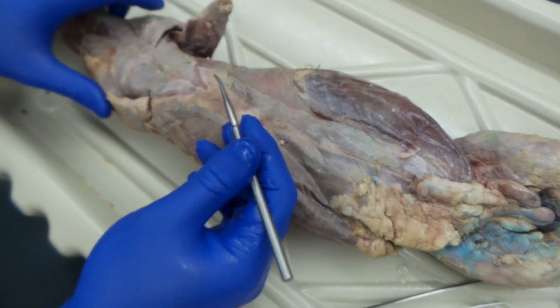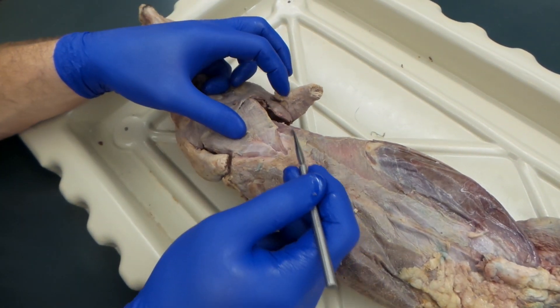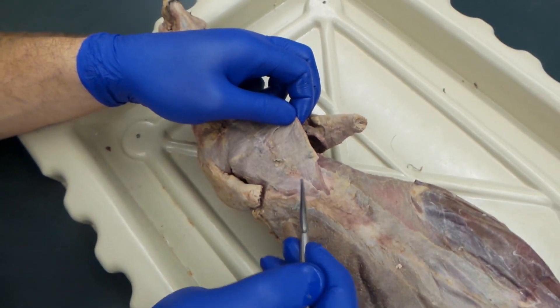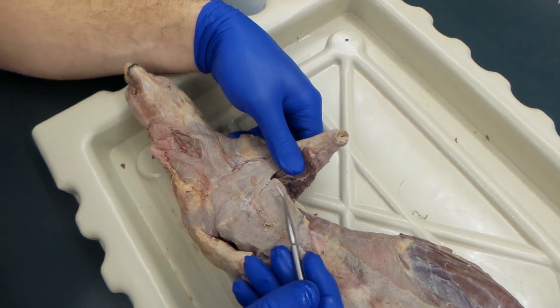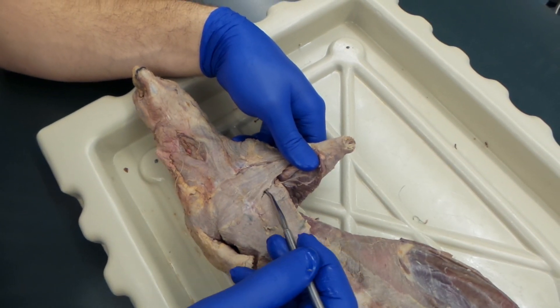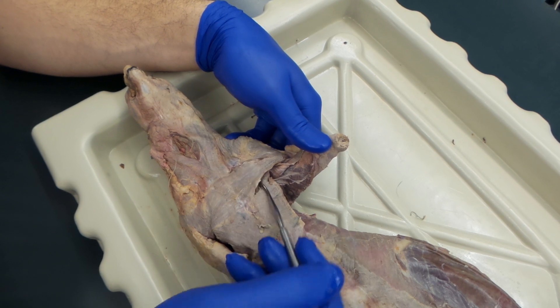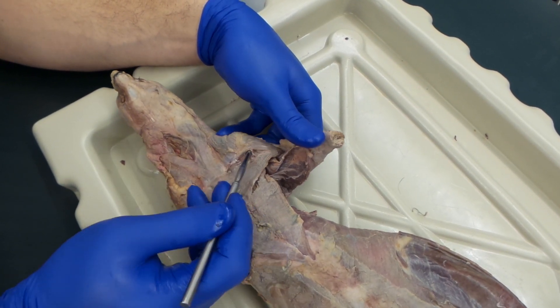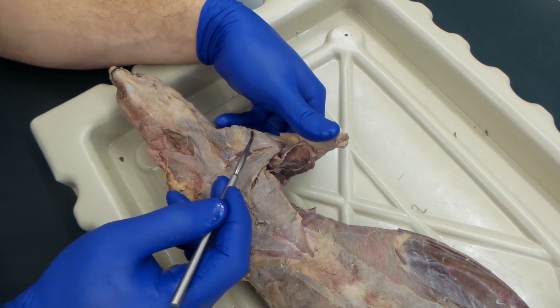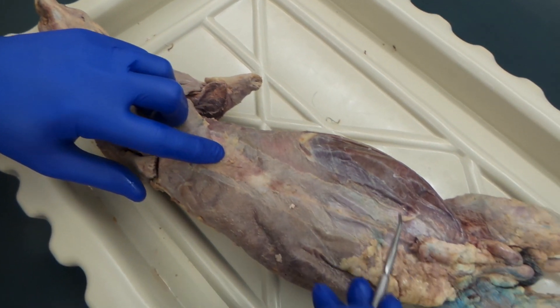Moving on up to the pecs. In the cat, you have a xiphihumeral that runs up — the mink doesn't have that. So this is all pec minor, and then the pec major runs right over the minor. You can kind of lift it — there's pectoralis major. You can separate that from your clavodeltoid. So: clavodeltoid, pec major, pec minor, rectus abdominis.